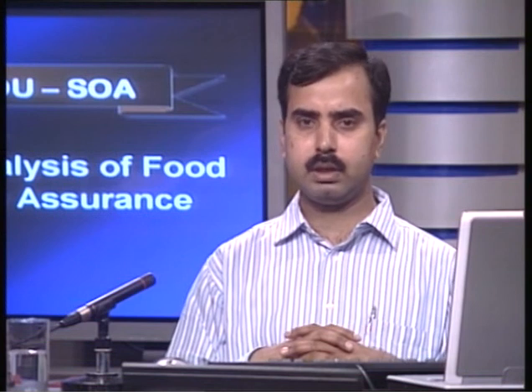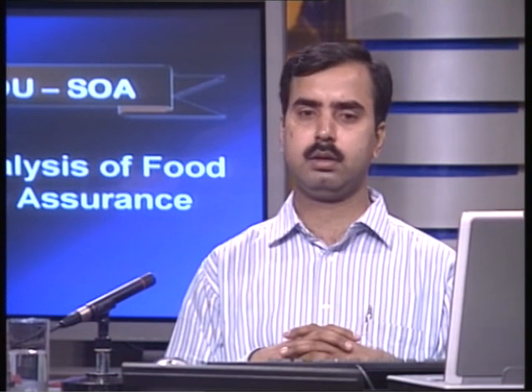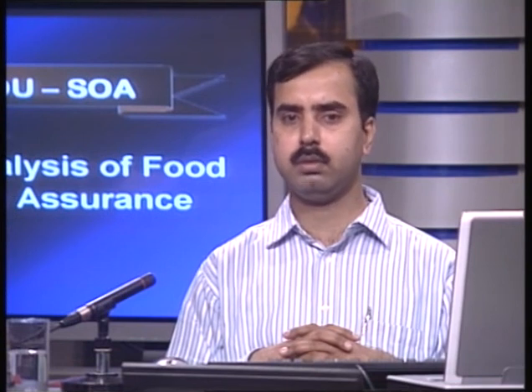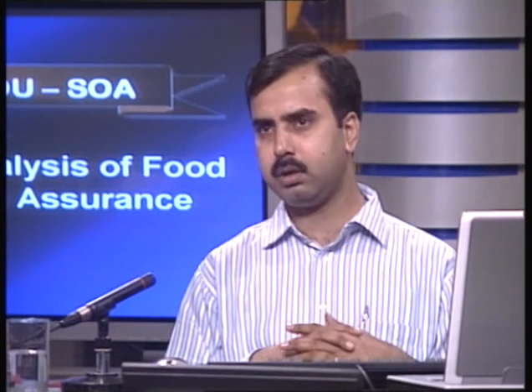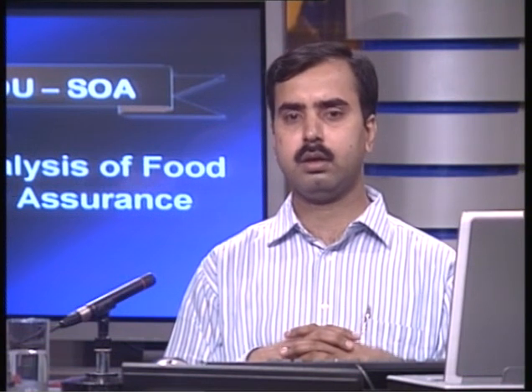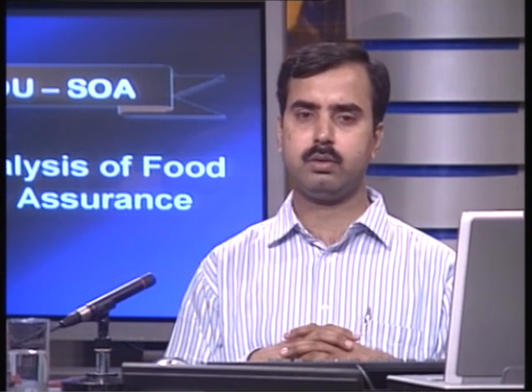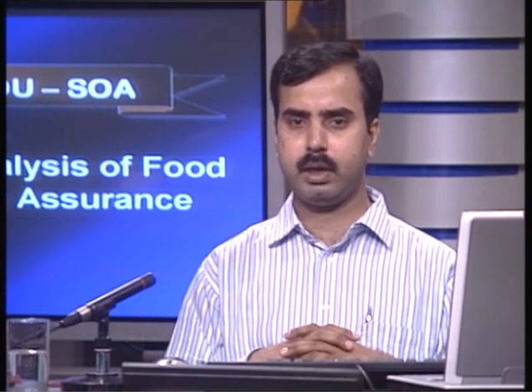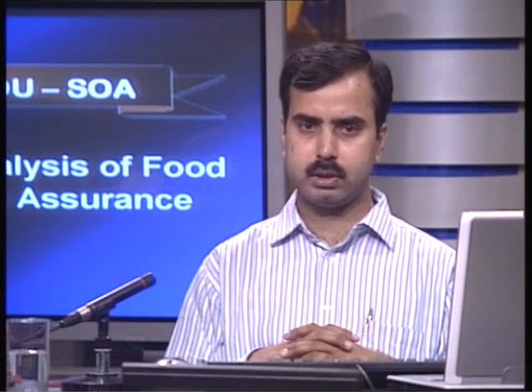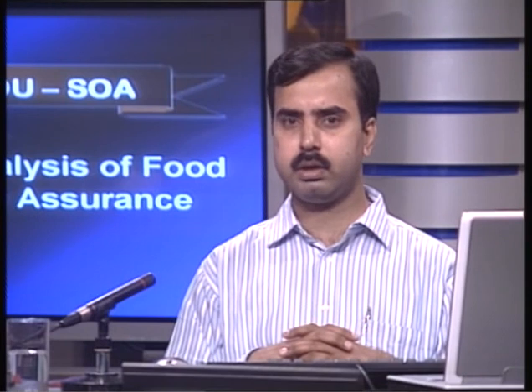If the sample has less quantity of vitamin A or any other analytes, you need to inject a little higher volume. In general it can be 20 microliter. In some cases, where the analyte is in a very trace amount, you need to inject a very high volume, maybe 400 or 500 microliter.